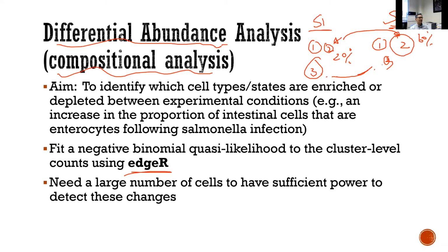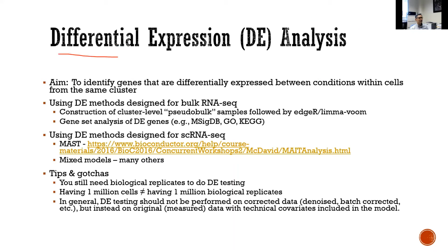So this probably is something even beyond the differential expression. And then you want to first count the proportion change, composition change across two different samples. So after that, independently of whether you found a composition change or not, the next step you probably want to use is differential expression analysis applied to single cell RNA-seq, if you have data from two different samples.